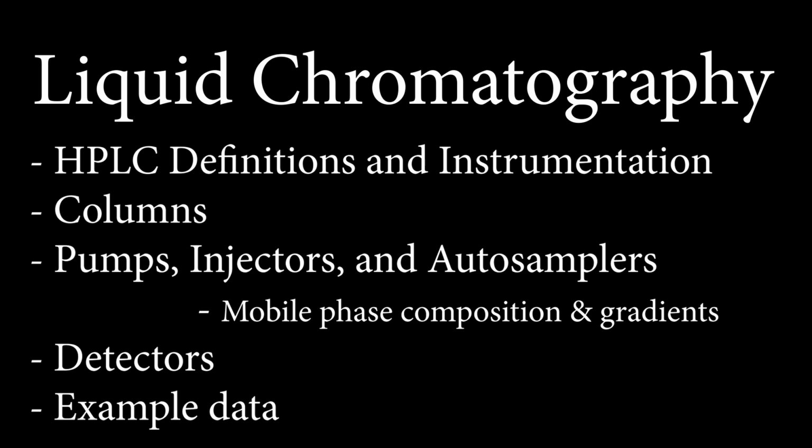Okay, so we covered some of the definitions of vocabulary associated with HPLC. We talked about columns, their dimensions. We talked a lot about the particle size and the phases that determines the chemistry of the stationary phase. And then we talked about some logistics for the pumps, which are really important because they output the pressure and they push the solvent, the mobile phase, through the stationary phase.